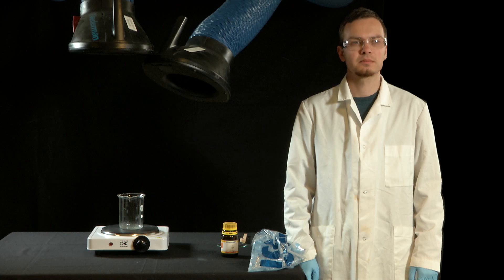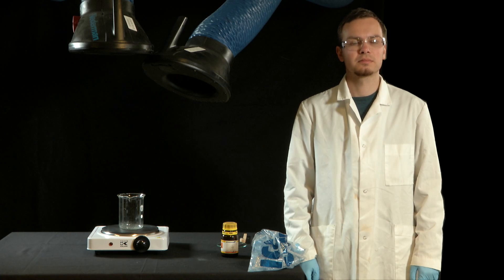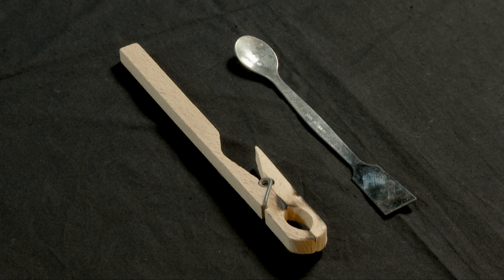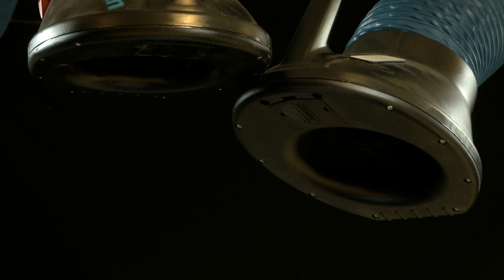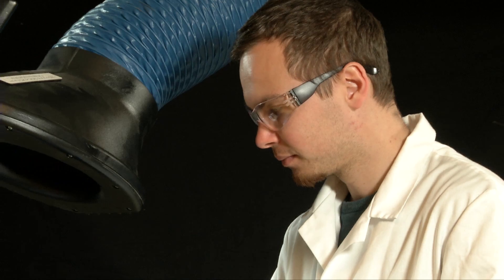But remember, iodine both in solid and gaseous phase can be toxic. To handle iodine, you need both goggles and gloves. You also need a fume hood to ventilate and prevent a high concentration of gaseous iodine in the room.